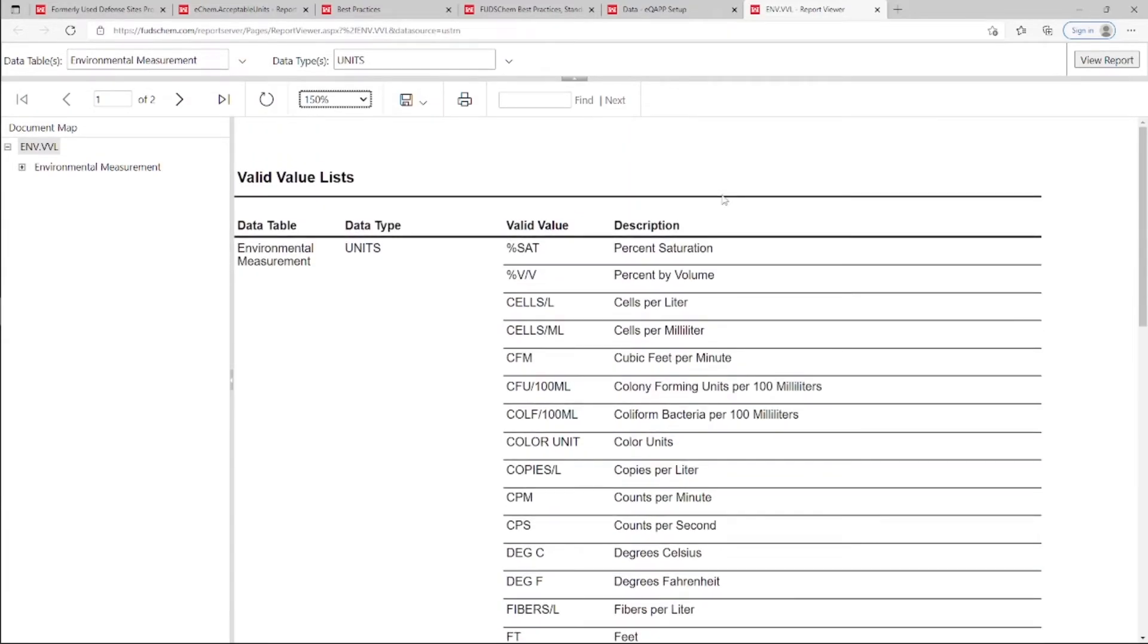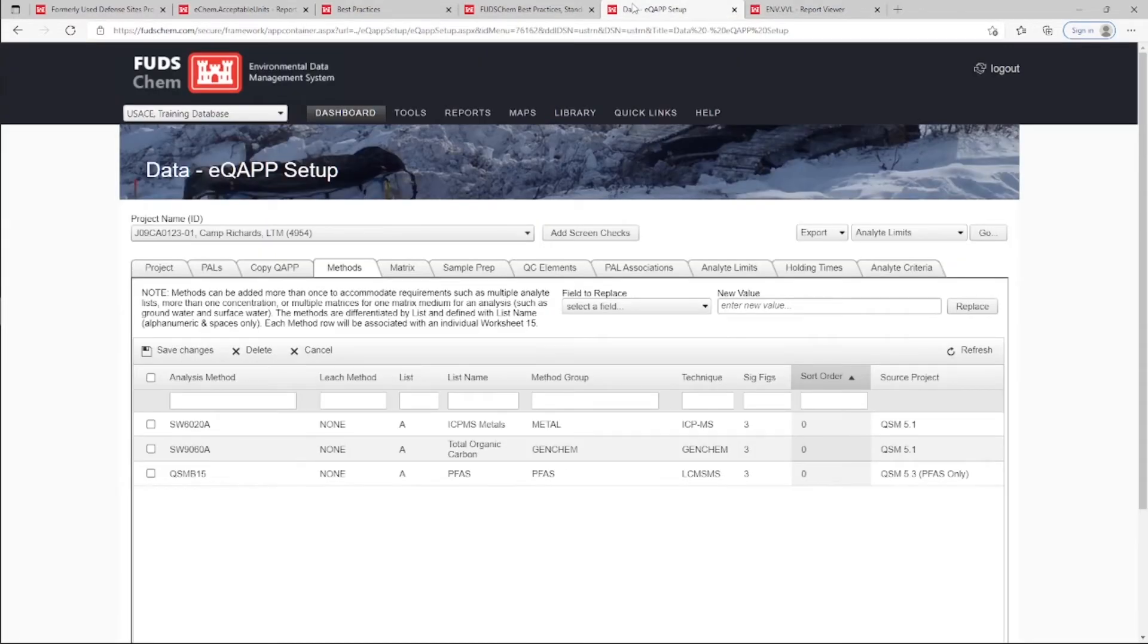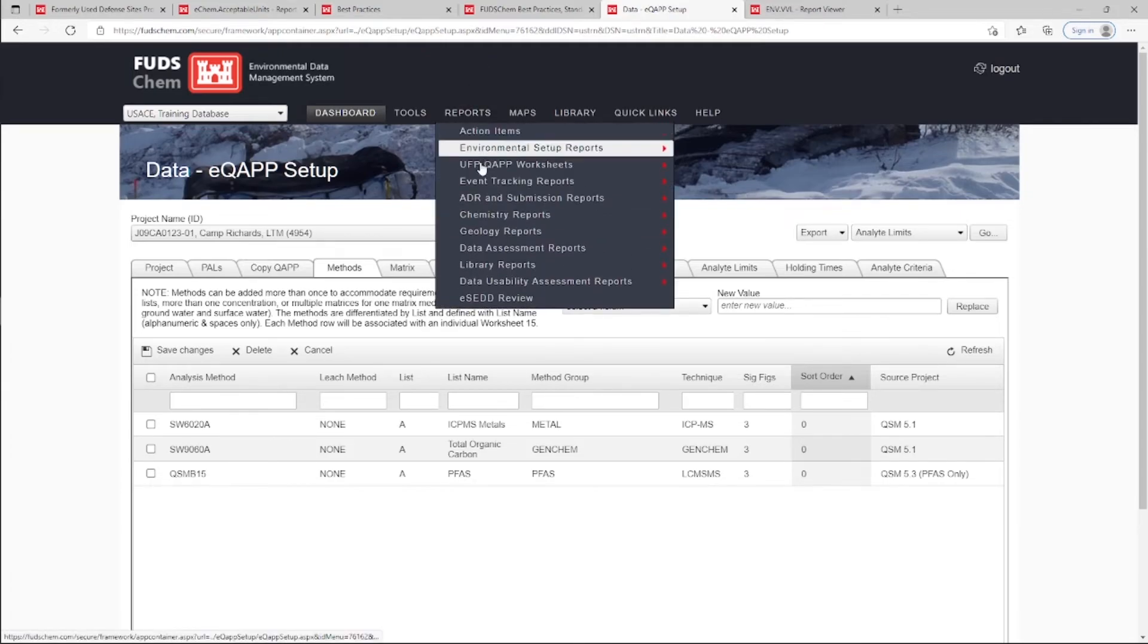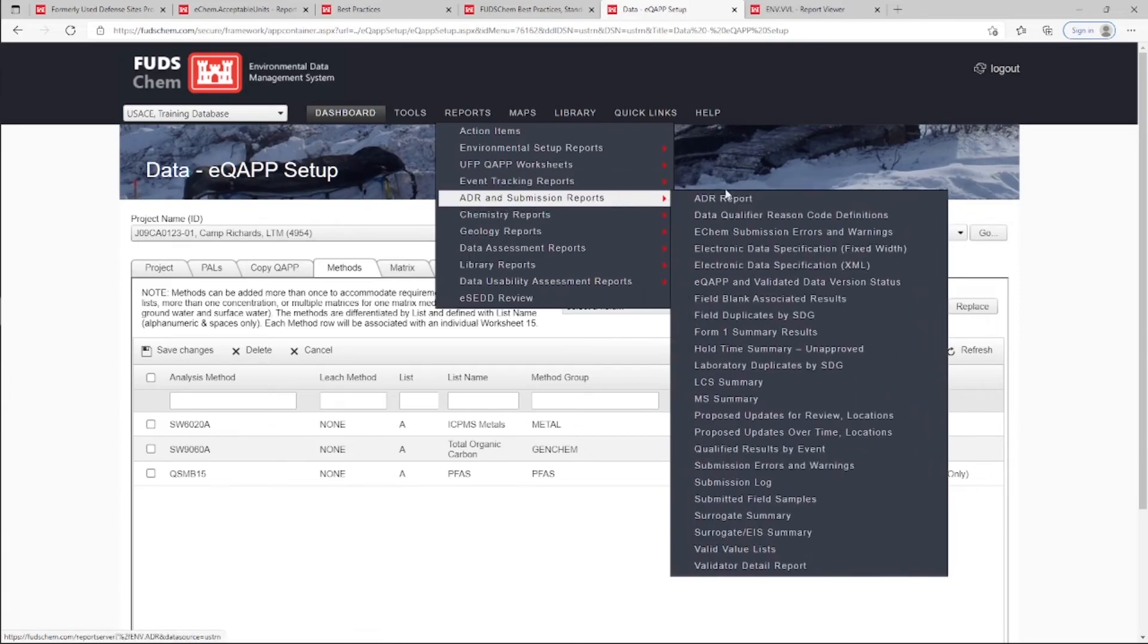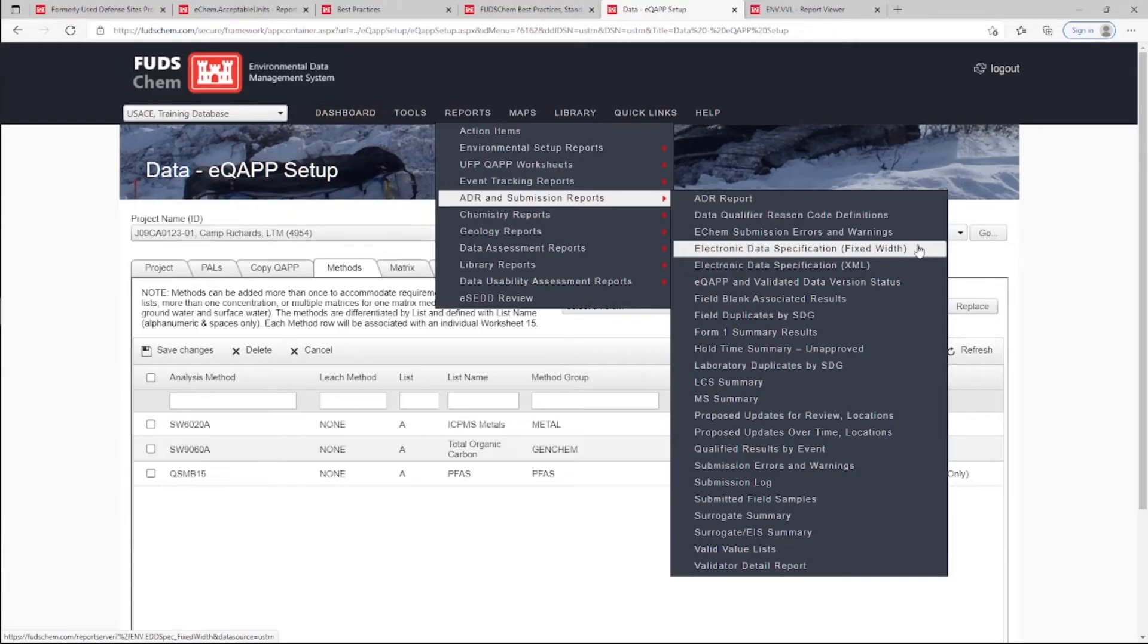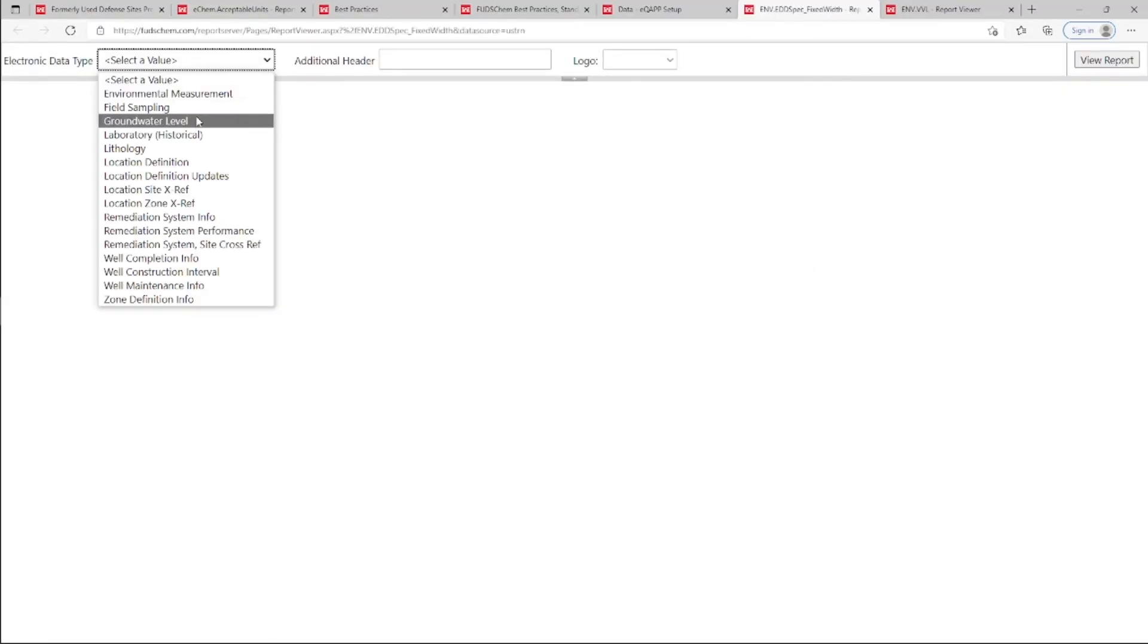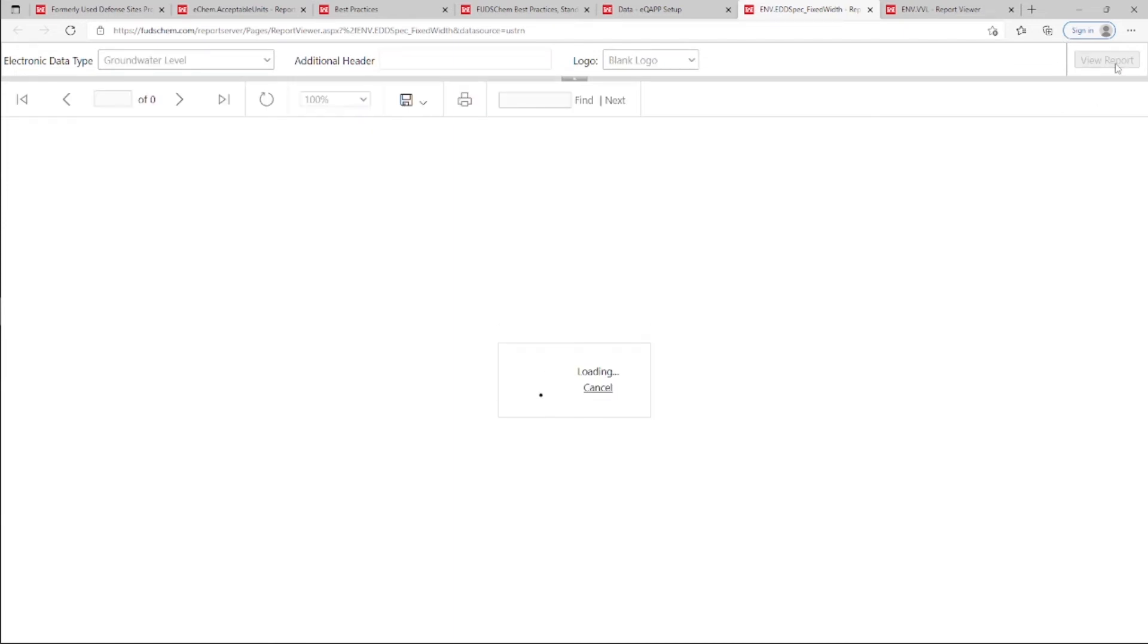For some non-chemistry data types, units are not entered manually because a specific unit is required per the electronic data specification. Go to Reports, ADR and Submission Reports, Electronic Data Specification Fixed Width. Choose the electronic data type, for example, Groundwater Level, and click View Report.